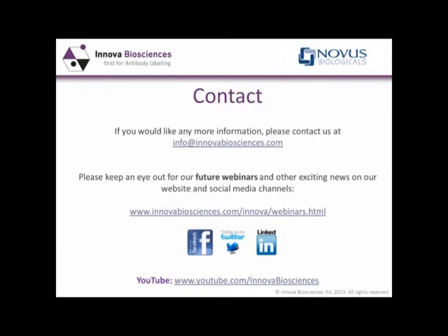The next question is, do you need to read Malachite assays at a specific wavelength? Sorry, I forgot to mention that the best wavelength is 650 nanometers, but anywhere from 590 up to about 650 is fine. So if you don't have a 650 filter, you've quite a broad range there. The main thing is when you've selected a wavelength, just stick with it, so that you can compare results from different experiments.